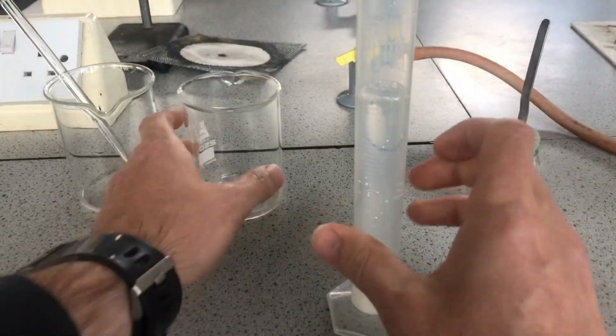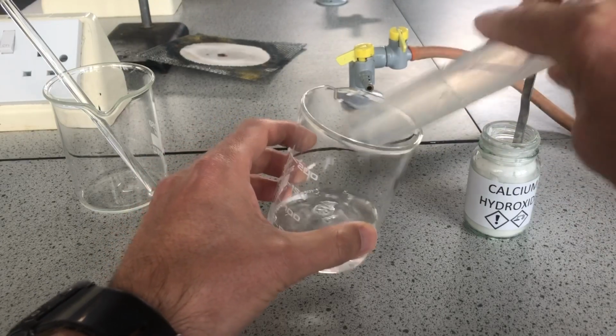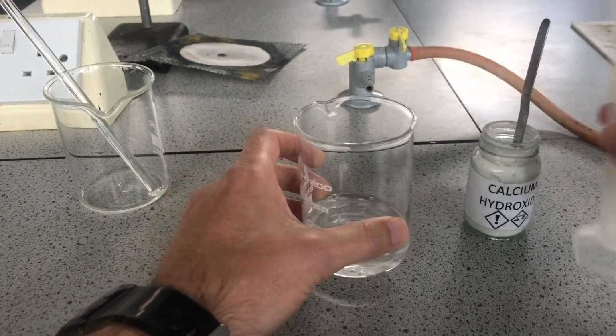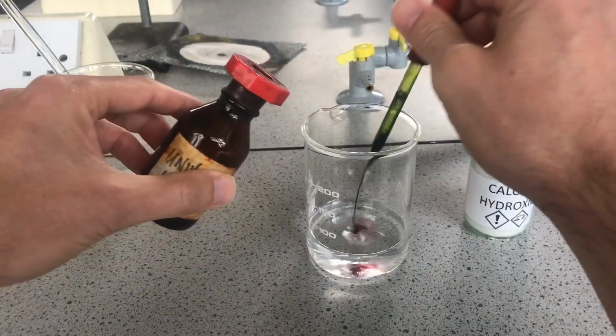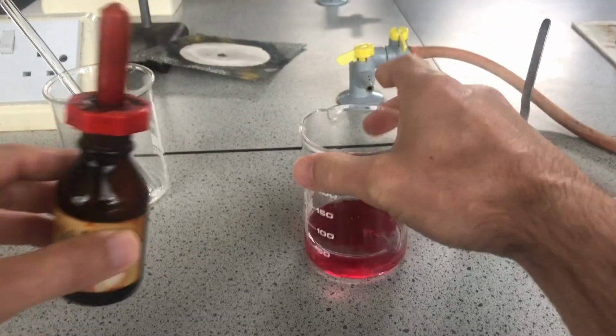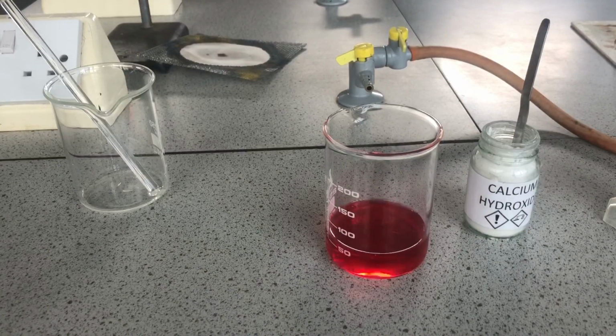So we'll put that straight into this beaker, which is what we're going to do the practical in, and we need an indicator. We'll use universal indicator, and we just need a couple of drops of that into there. Give it a swirl. We've got a nice red colour, so that's a strong acid.